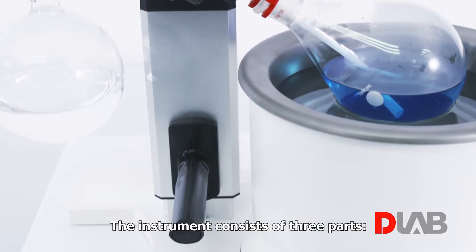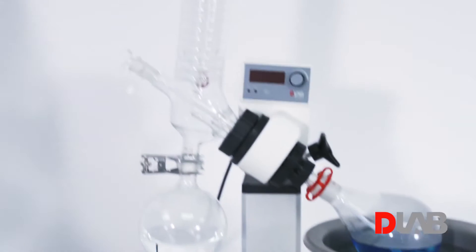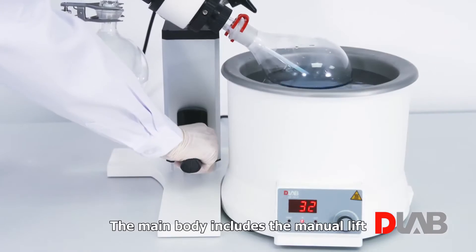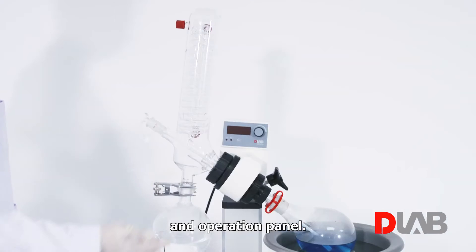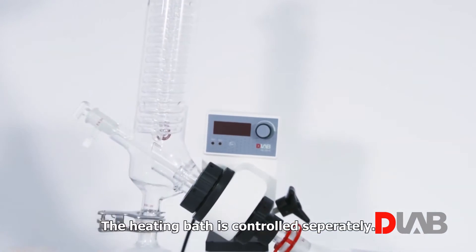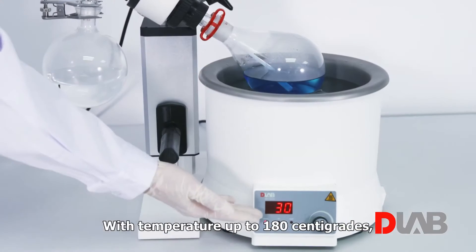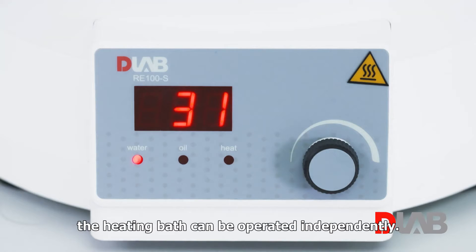The instrument consists of three parts: the main body, heating bath, and glasswares. The main body includes the manual lift and operation panel. The heating bath is controlled separately. You can switch between the water and oil bath, with temperature up to 180°C, and the heating bath can be operated independently.